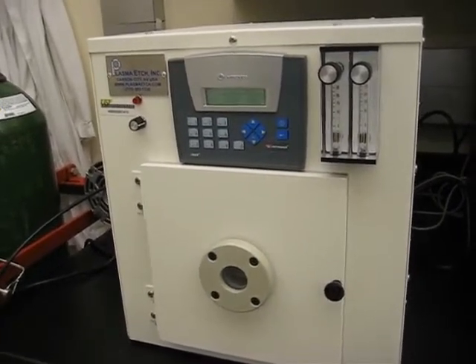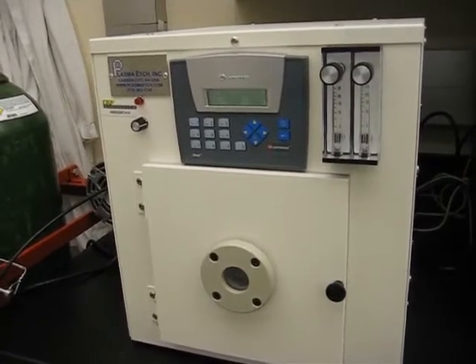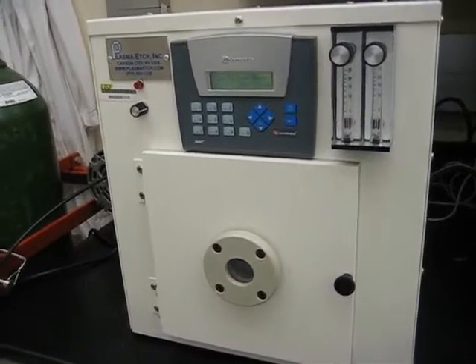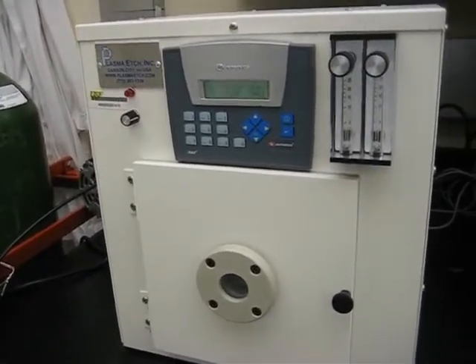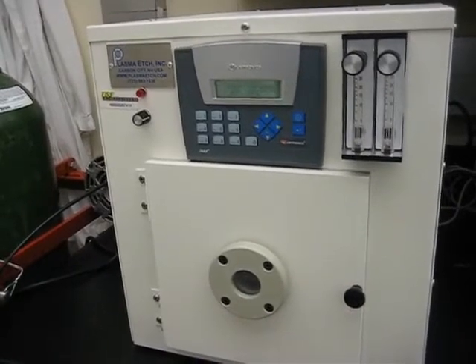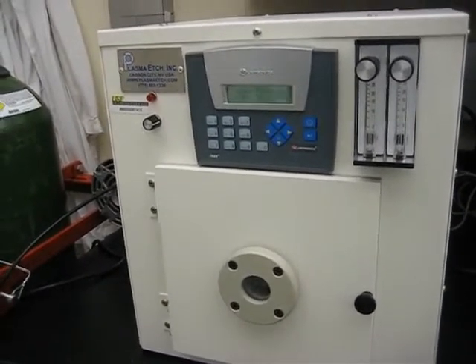Are you only using oxygen right now? Yes, oxygen. You have the second gas control. Yes, but we're using air for now for purging. We can connect nitrogen if we require, but right now it's just running on oxygen.